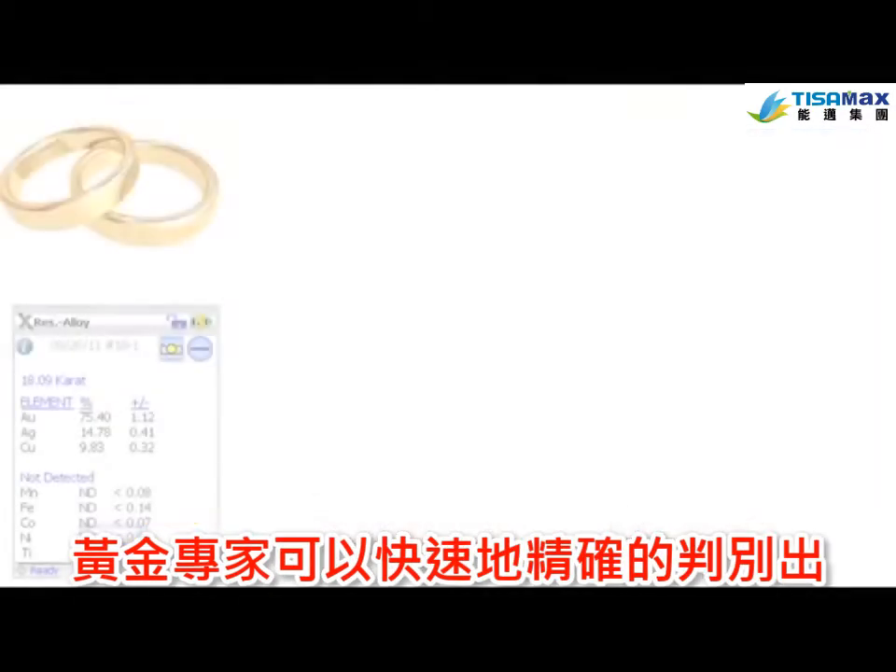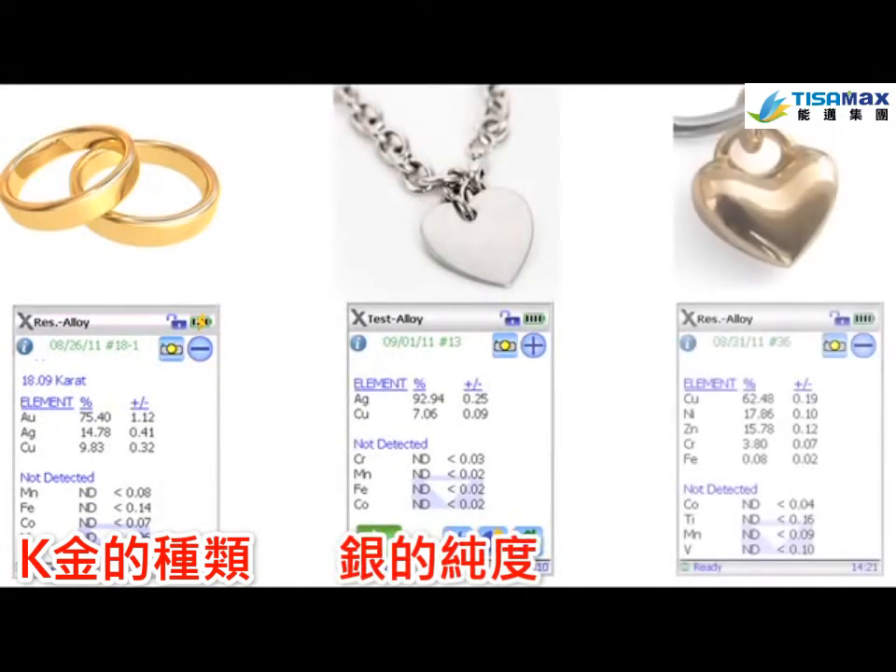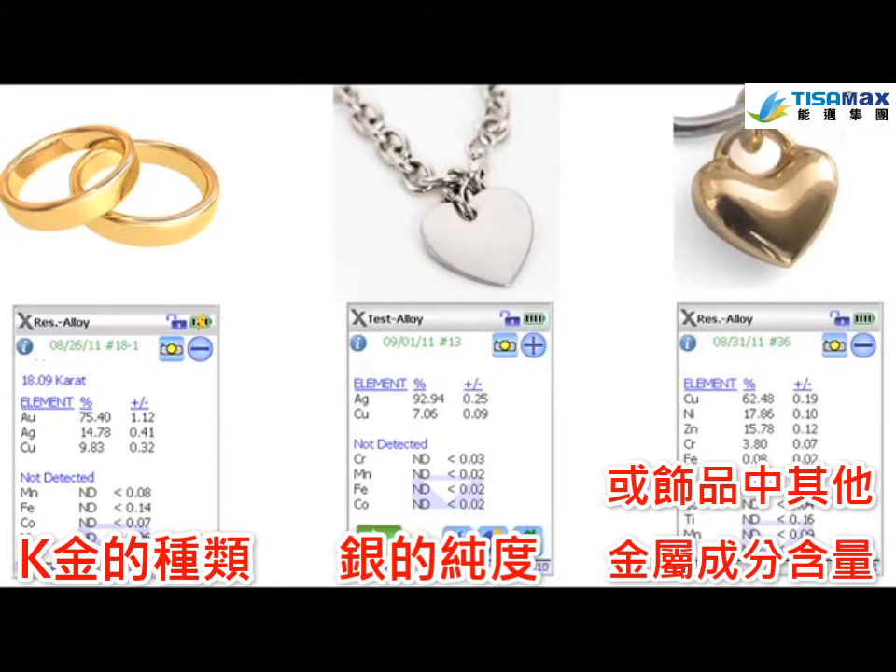The Gold Expert quickly and accurately determines the karatage of gold items, the purity of silver items, and any other metals that are in the piece.